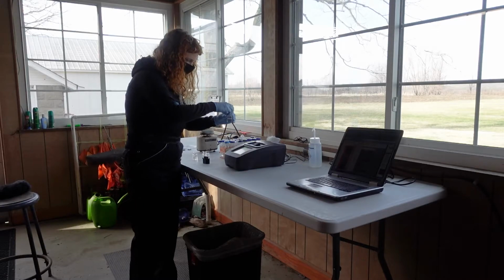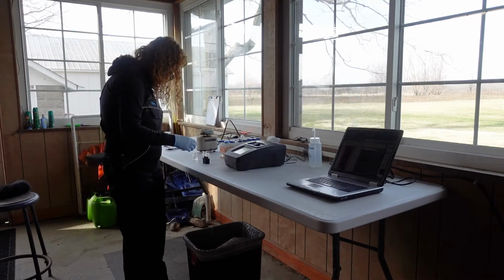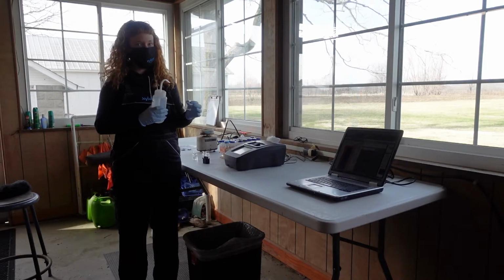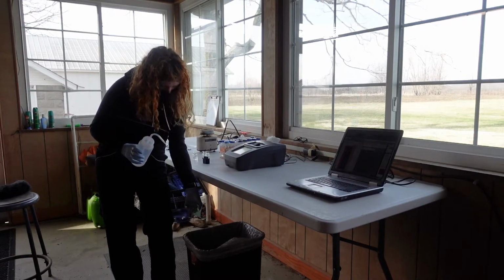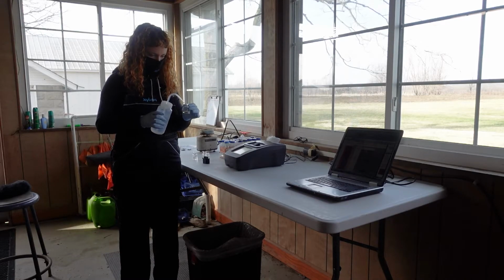So what I'm going to do is remove my cuvette. I'm going to dump my waste into the waste bucket. I'm going to take some DI water, so it's important that we're not cross-contaminating samples. So what I will do is I will rinse the inside of the cuvette, dump into my waste bucket. We'll do that 2 times.